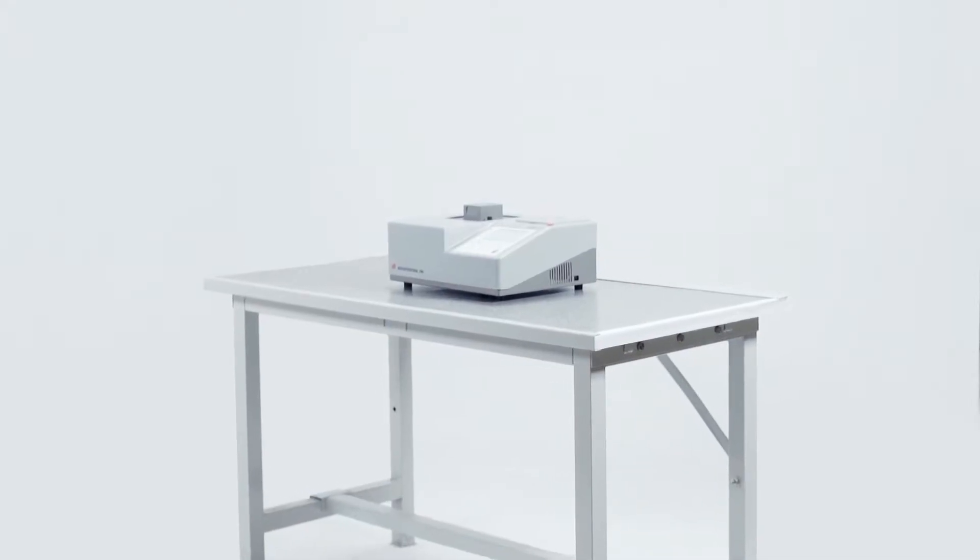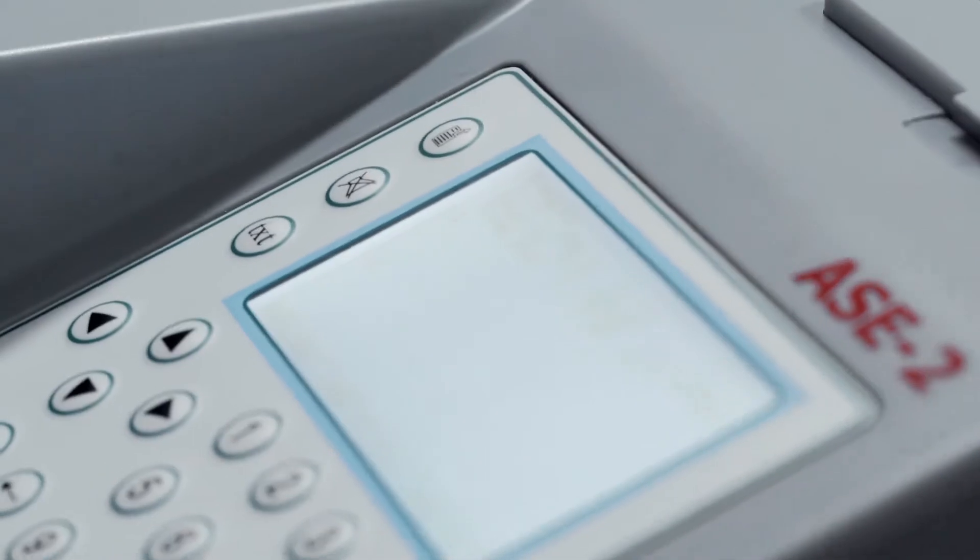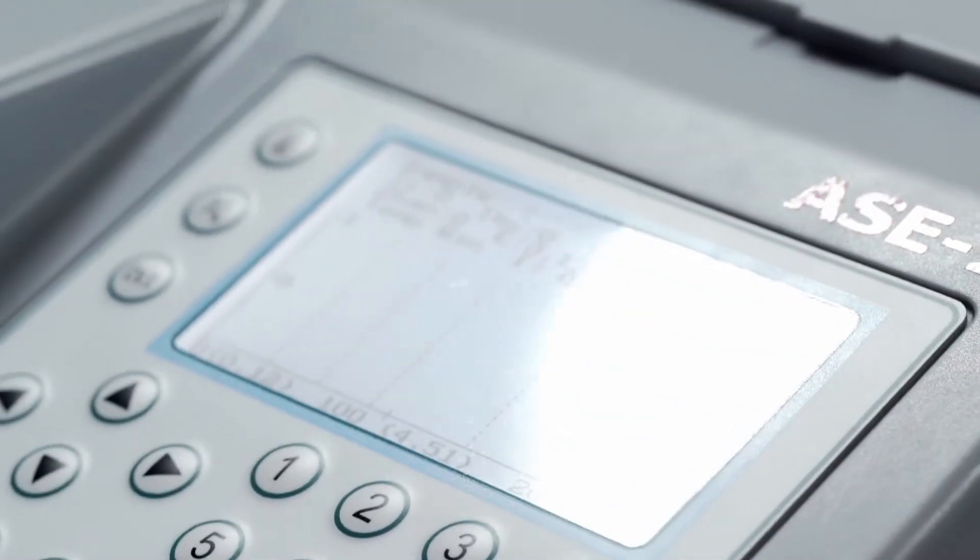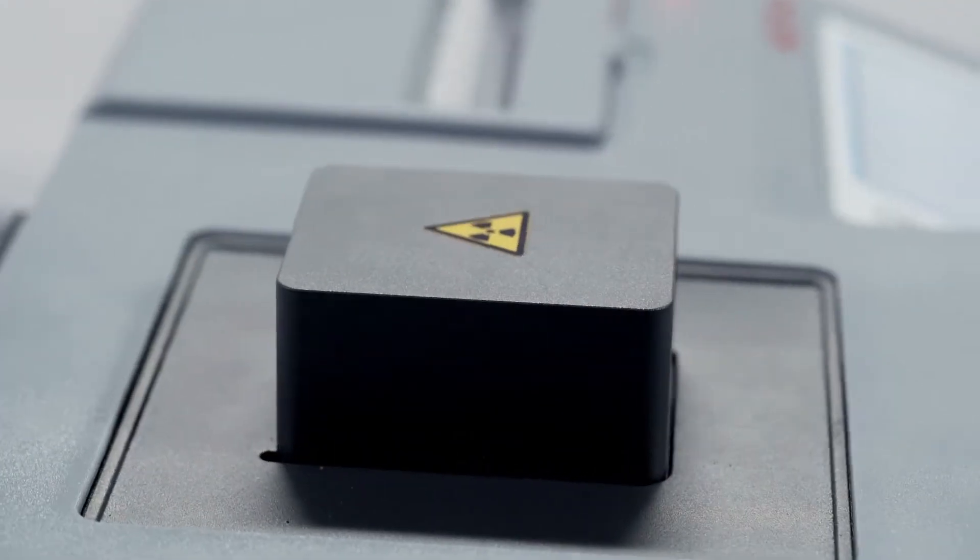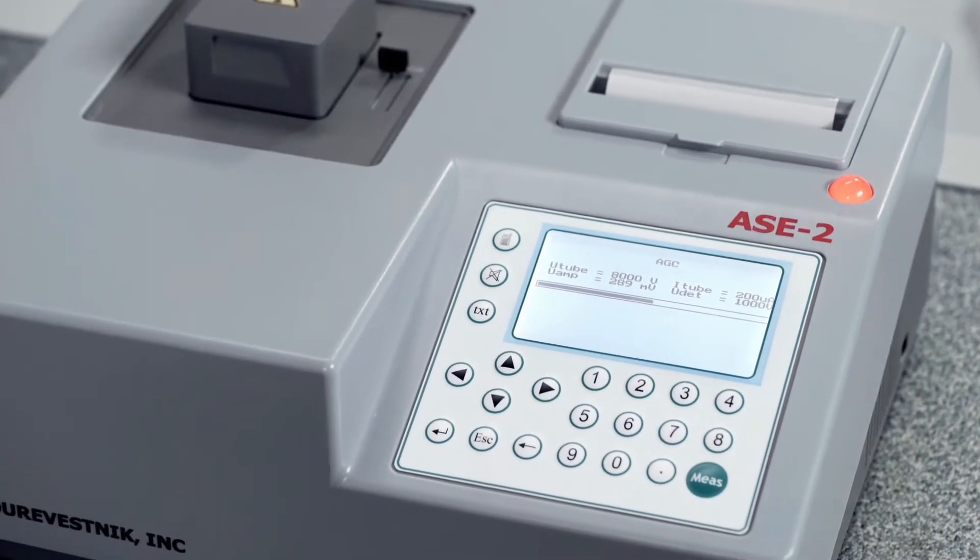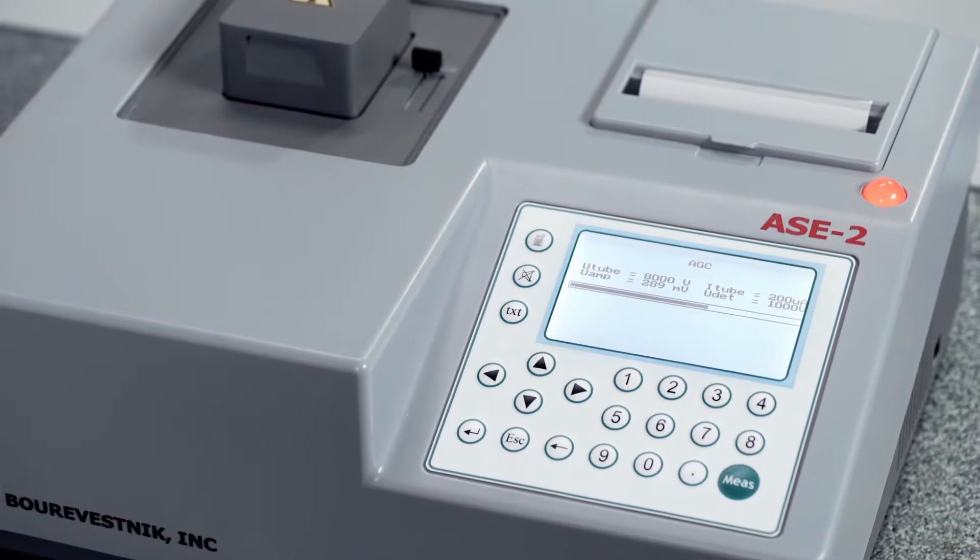X-ray fluorescent energy dispersive sulfur analyzer ASE2 realizes the reference method of sulfur mass fraction estimation in oil and oil products and allows analysis of motor fuel, diesel fuel, kerosene, and fuel oil.